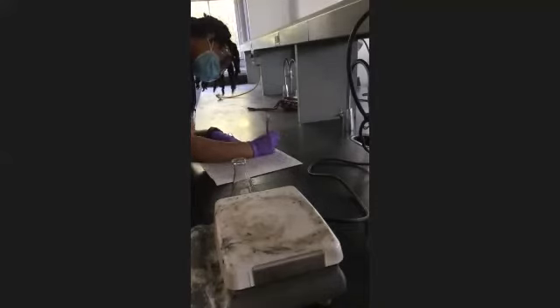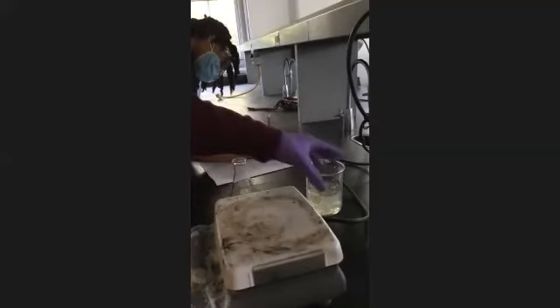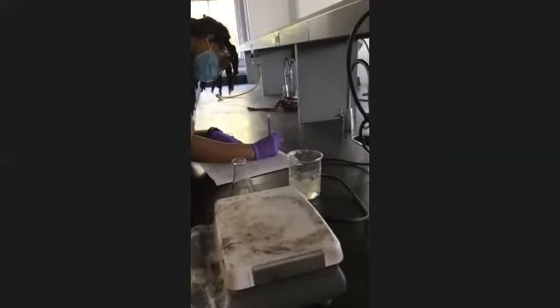So we're going to add water, and then we've got an ice bath set up. And so we're good. Go ahead and dump your water out of your beaker. Yeah, just dump it down the sink. Or dump it, yeah, you can dump it in that sink right there.